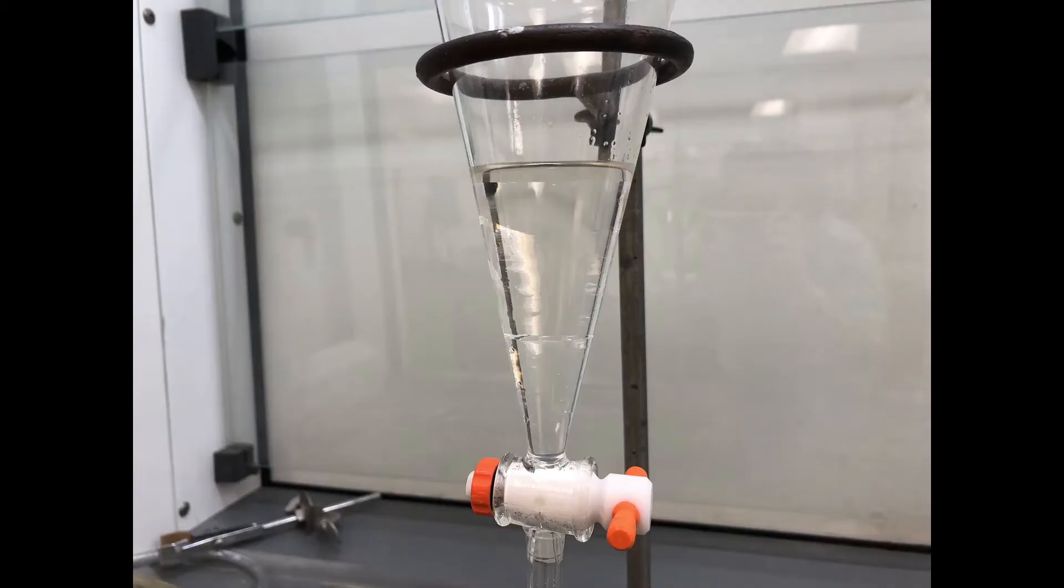It is your job to distinguish between your aqueous and your organic layer. Your aqueous layer will be the layer that contains water and the organic layer will be the layer that includes your ether and other organic material. You are also able to determine which layer is which by calculating the density of your compounds in your mixture. The layer that is more dense will always be at the bottom. For this lab, your top layer will be your organic layer and your bottom layer will be your aqueous layer.